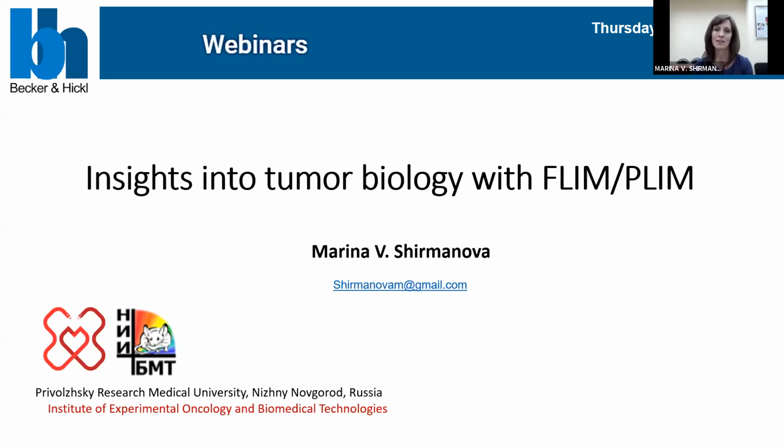In our studies, we are trying to understand the complex biological behavior of tumors with the use of optical techniques, including fluorescence lifetime imaging and phosphorescence lifetime imaging. Today I will show you some examples of how these techniques can be used for cancer studies, and I will explain why we like these methods.